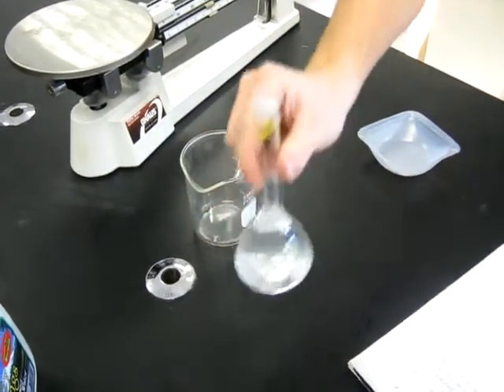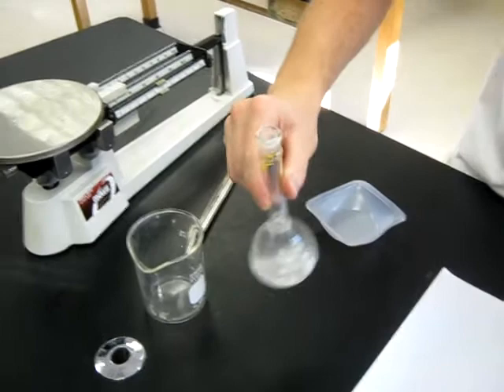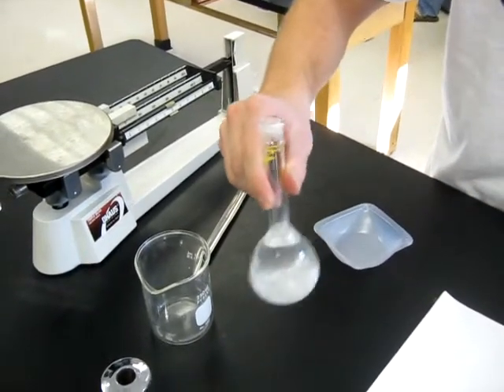Okay, and now we have our pellets sitting at the bottom there, so we just swirl this around until they dissolve, and we should have our 0.5 molar NaOH.